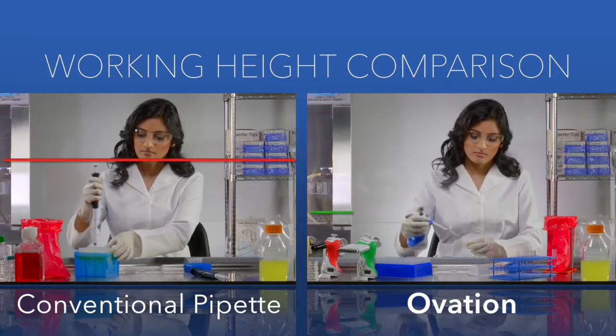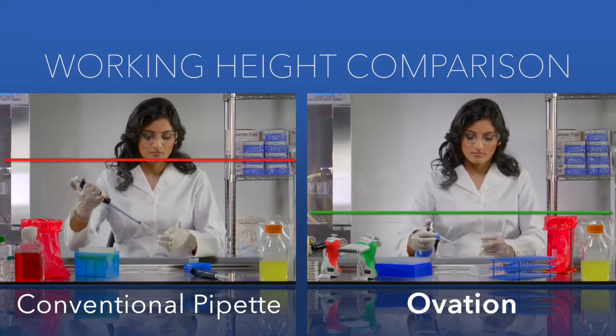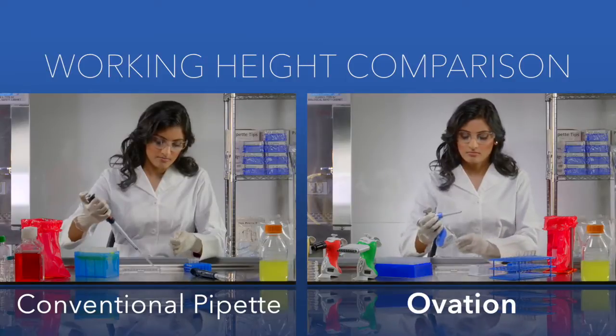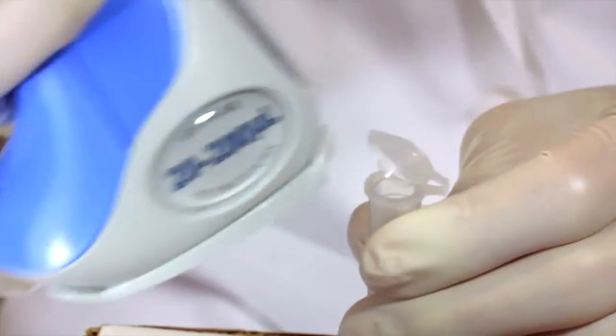Unlike your typical pipette, Ovation is great under the hood. Ovation's shape allows you to work comfortably in a natural posture, and its unique EZ-Camp opener saves time and thumbs.